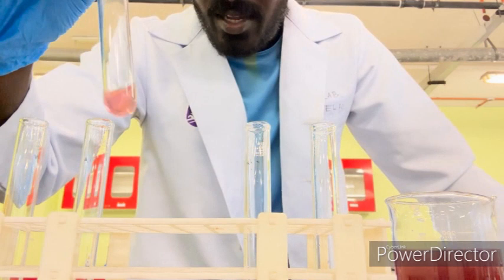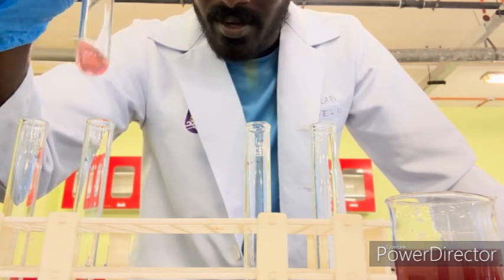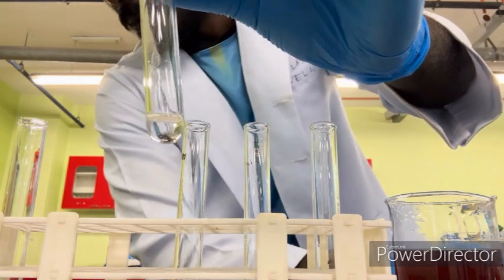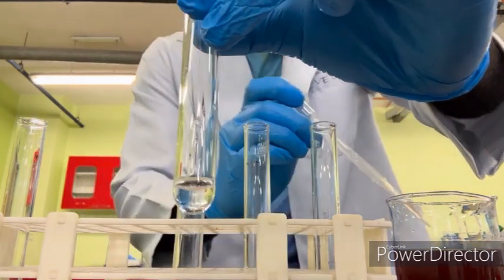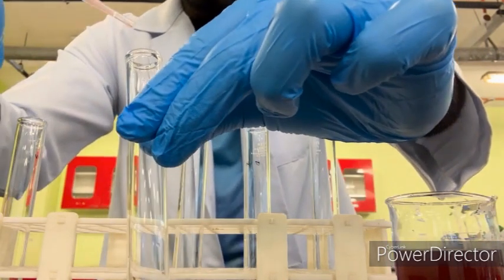Okay, so this one for HCl, you can see there's a massive change of colors. And this one is 1m acetic acid. Okay, I'm going to add a few drops of solution.